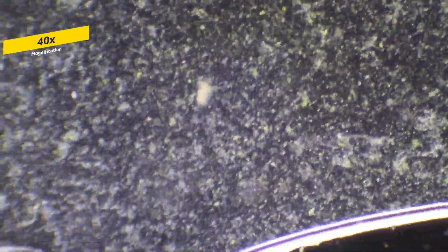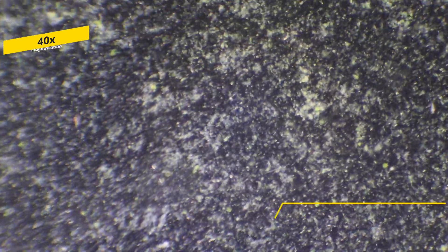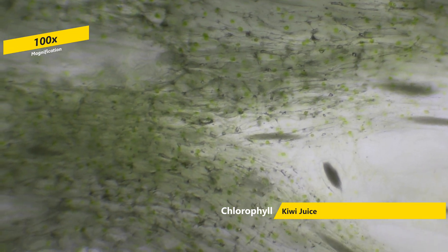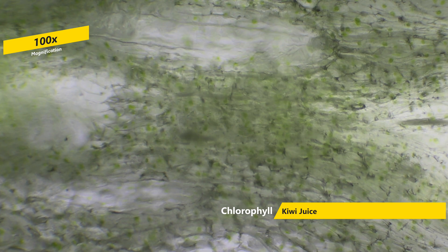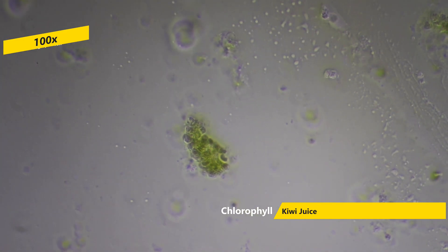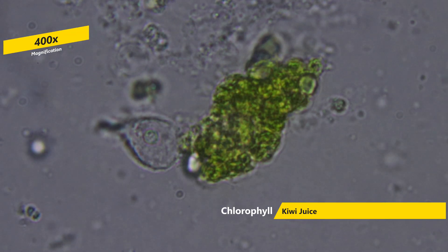Next, we have a drop of kiwi juice. There is movement because of the liquid moving under the slide. However, these green orbs are the kiwi's chlorophyll, which can be seen more structured in the fruit. The chlorophyll is responsible for absorbing light and is essential for photosynthesis, which helps sustain the plant's growth.